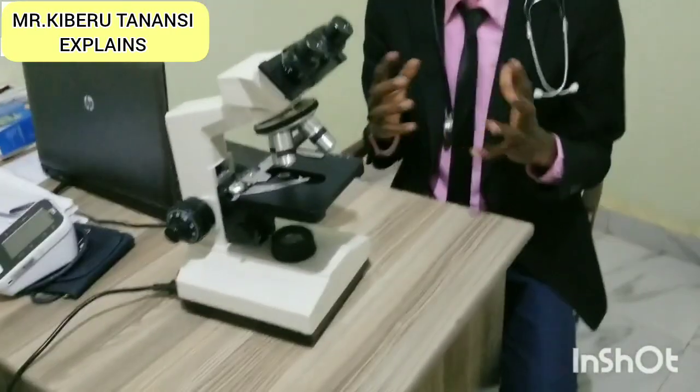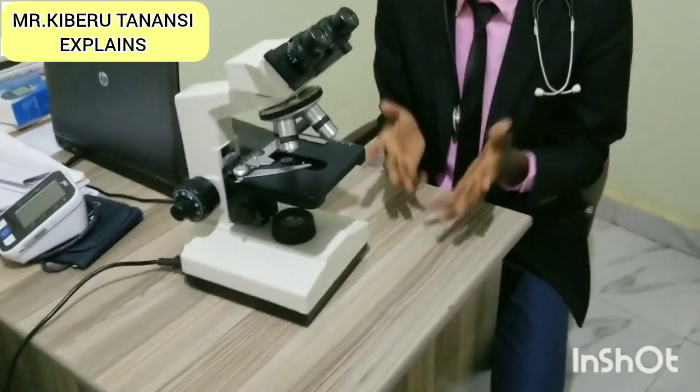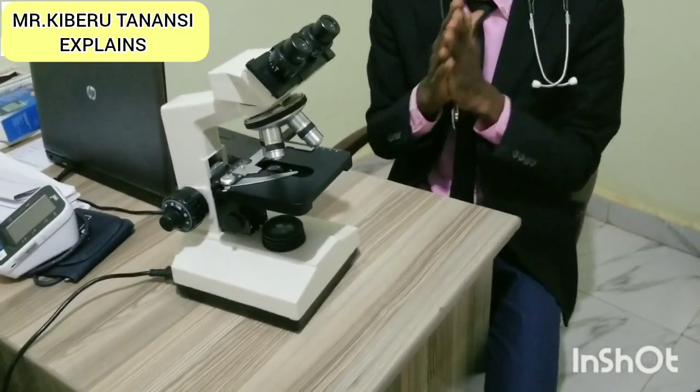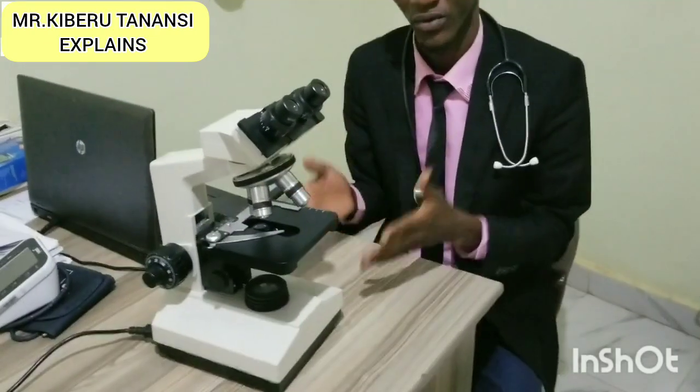As I told you, it is very easy to use. It is cheap to buy, it is cheap to maintain, and even easy to use. Even you, my senior learners, can use this microscope if I explain to you how to use it. So the next time we shall look at how to use this microscope.